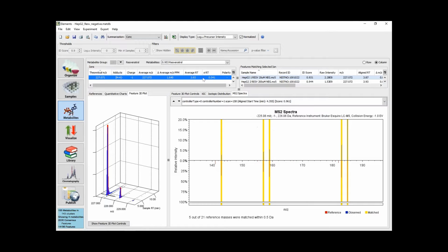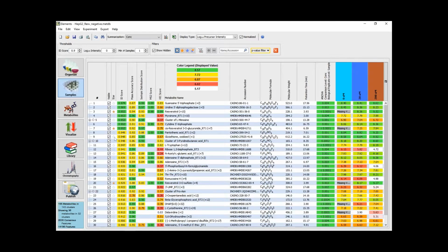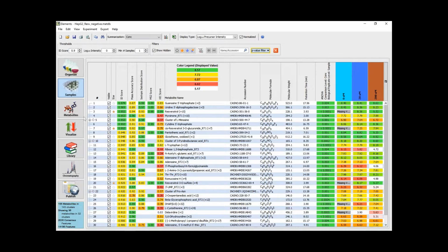Now what we'll continue to do is go back to the visualize pane, but in this case I don't want to just look at these 4 and how they change. I'll look at all the samples. I've done a comparison between the samples, between 0 micromole de novo, 20 micromole, and 200 micromole. So what I'm going to do is filter all the compounds that are 0.05 and lower than that. And then I'll go to this Visualize tab.